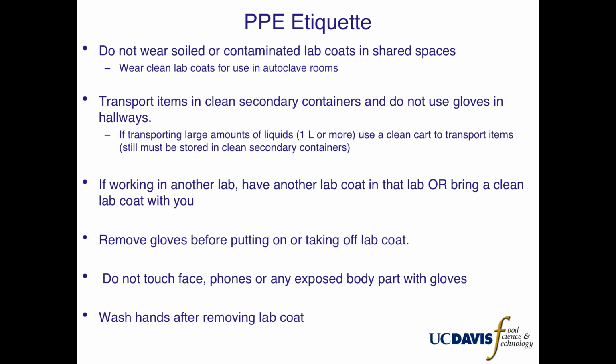I have seen people touch biohazardous materials or chemicals with gloves, remember that they need a lab coat, then put the lab coat on with those same gloves. Doing this contaminates the inside of your lab coat and therefore any part of you touching the lab coat. Do not touch your face, phone, headphones, or any exposed body part with gloves. Doing so can contaminate your skin or personal items with any of the hazards that you have on your gloves.